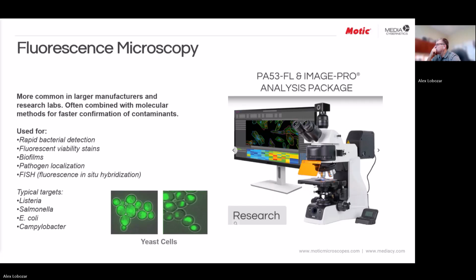The fluorescence can be added to some of our other scopes. We have some limited fluorescence applications on our Panthera, but we also have fluorescence applications for inverteds if needed. So that covers the majority of those for that part of it.